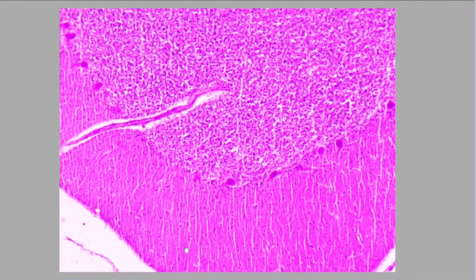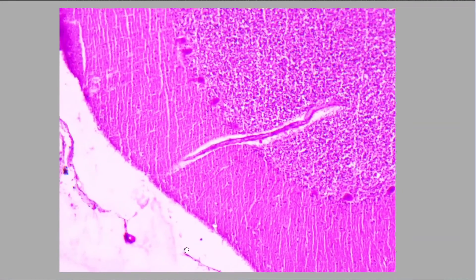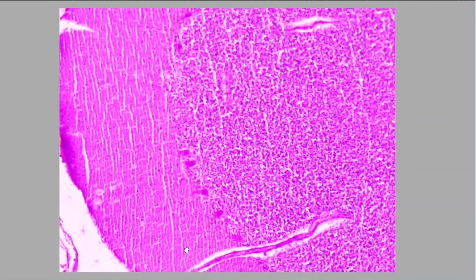If you look along the same line under high power, you will find Purkinje cells one after another — another cell, then another cell. So all these cells are arranged in one line, and this line represents the arrangement of a necklace. This necklace has only a single layer of darkly stained cells, present in a single line throughout the slide. Identifying the Purkinje cell is the classical characteristic feature of the cerebellum slide.